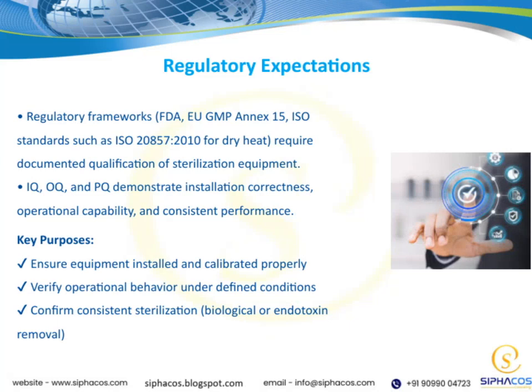Let's talk about the regulatory expectations surrounding sterilization equipment. Regulatory frameworks like the FDA, the EU GMP Annex 15, and ISO standards for dry heat all emphasize the importance of properly documenting the qualification process. This documentation is crucial because it provides evidence that the equipment meets the required standards and is fit for purpose.